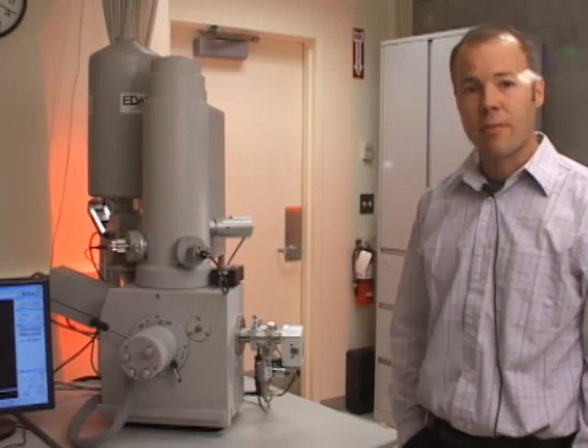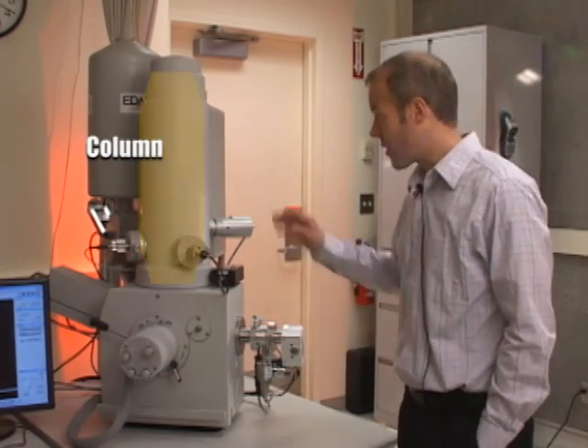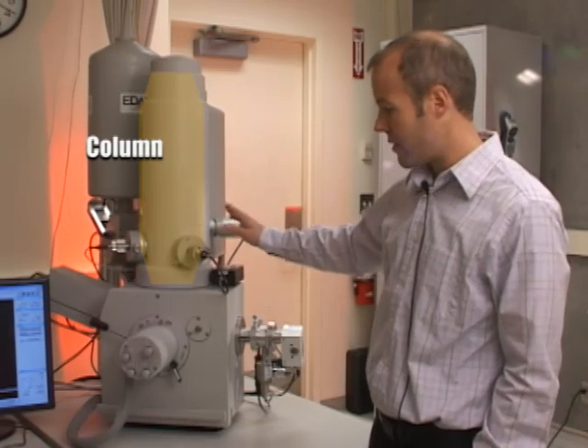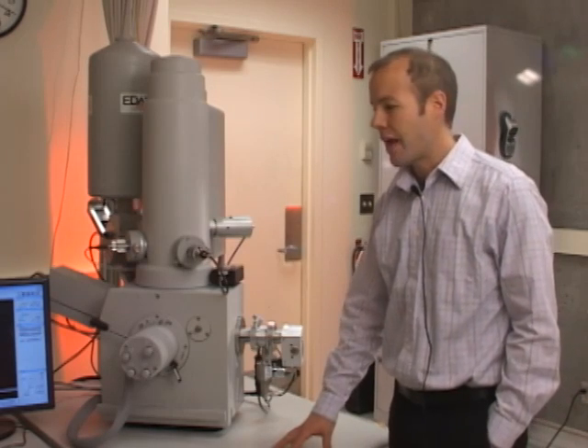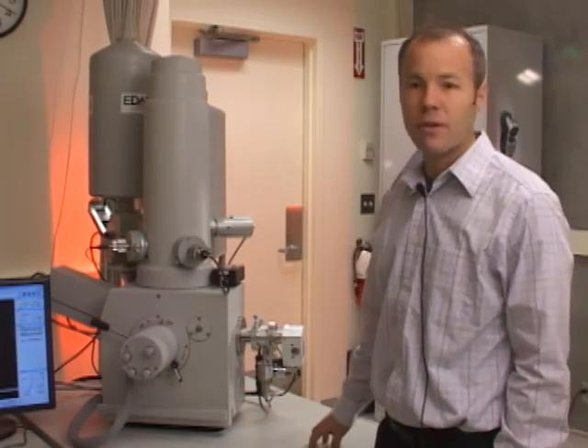The main parts of the microscope are the column — a cylindrical piece — and the chamber, which is the square section at the bottom. The system is mounted on a table, and to the left is the user console where you do all the microscope manipulations.